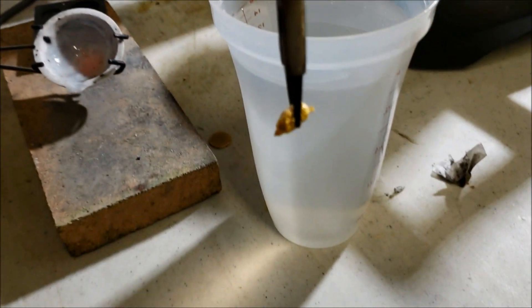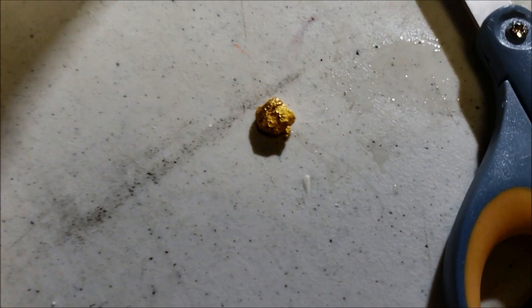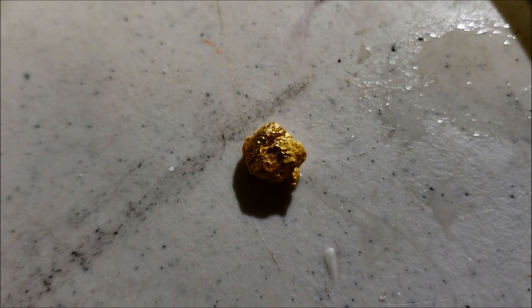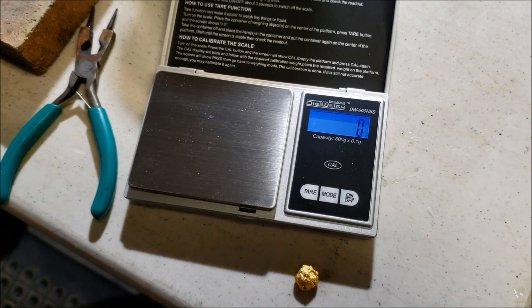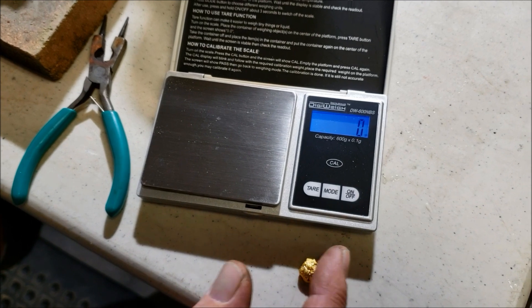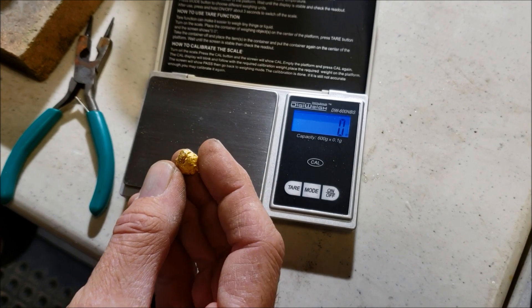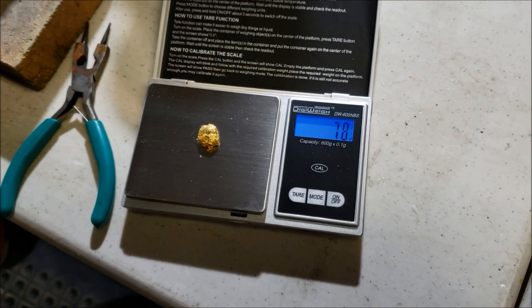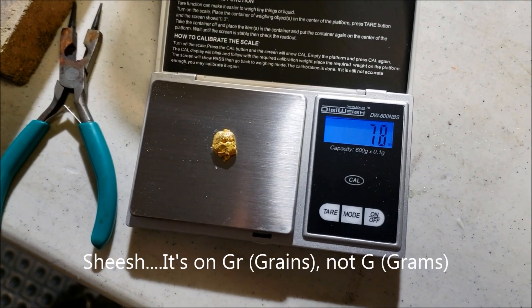Oh my gosh, look at that! There you go. We'll weigh it. When we started with the gold dust out of the dirt it was 10.645 grams. So now let's see how much we got here. Look how shiny that is - it's really shiny. Holy crap. 7.8. So we lost quite a bit.